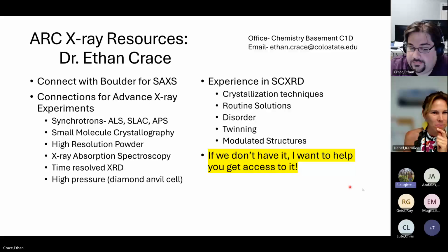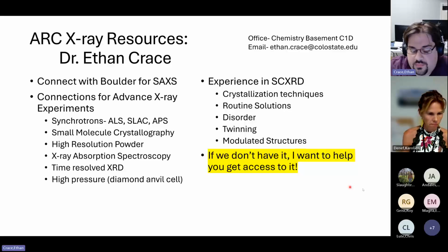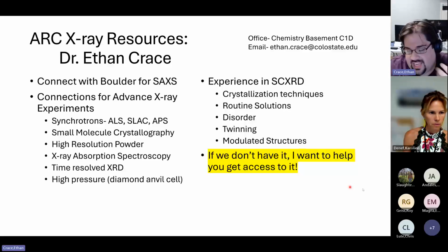Hi, Ethan, that was a wonderful presentation, really informative. I had a question on single crystal. Do you know the time frame to collect a data set, like how many hours it would take? It is highly variable. The time will depend on the symmetry of your crystal. Ballpark, it can take anywhere from 4, 5, 6 hours up to 30. It purely depends on how well your structure is crystallized, if you have heavy atoms, and if your crystal has a lot of symmetry elements, because the more symmetry it has, the less data we have to collect.